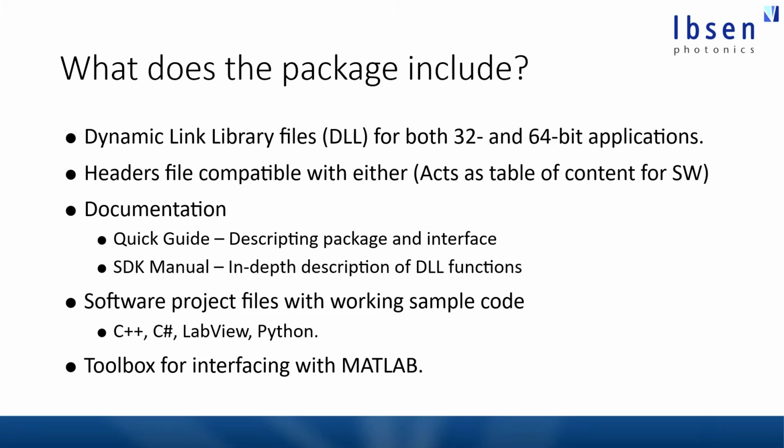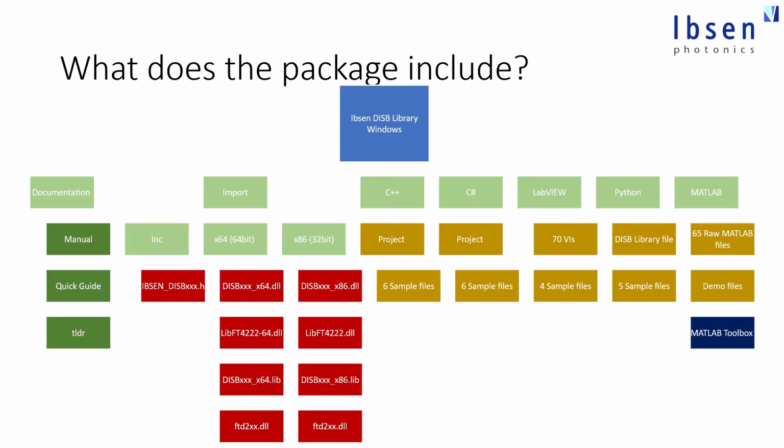These sample codes are written in C++, C#, LabVIEW, Python, and on top of that we have included a toolbox for interfacing with MATLAB should one wish to do that. In a more visual representation of the same thing, you can see here on top in the blue box we have the Ibsen DISB library folder.